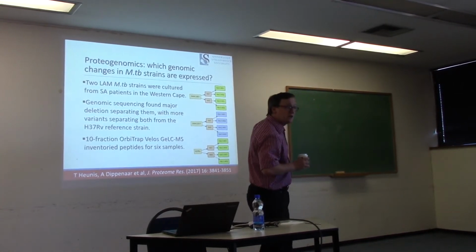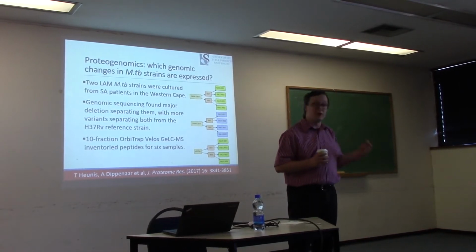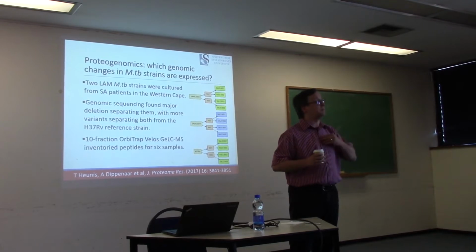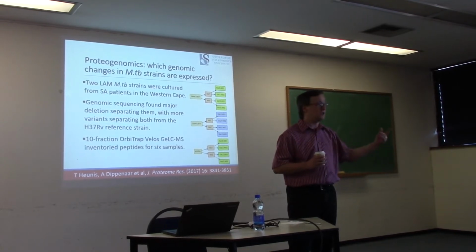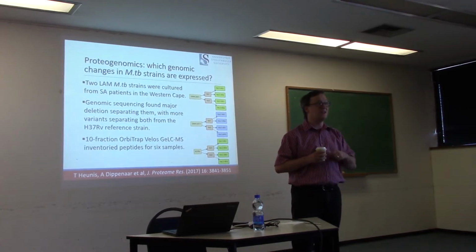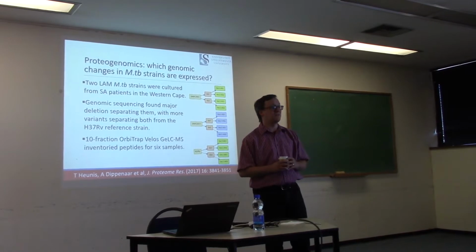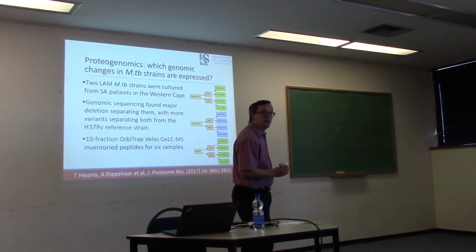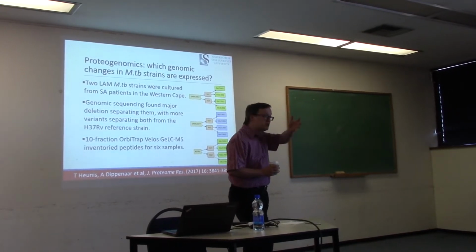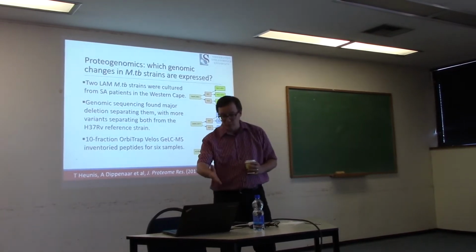So this spans 120 raw files. It's one of the larger data sets that I've encountered here because very frequently in South Africa, I see that people do not use fractionation in conjunction with their proteomics experiments because it's expensive. Suddenly, instead of paying around $100 for an LC-MS/MS experiment, you're paying $1,000 for 10 shots. So that is an expensive proposition. On the other hand, this approach, this gel-LC-MS, lets us look much deeper into these proteomes and get much better sensitivity.